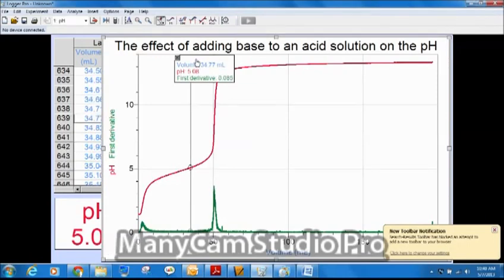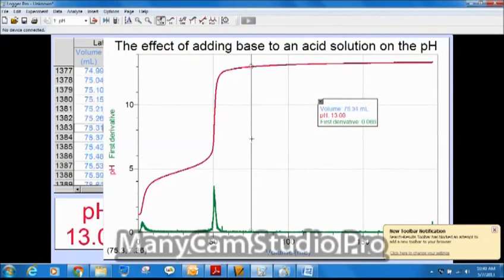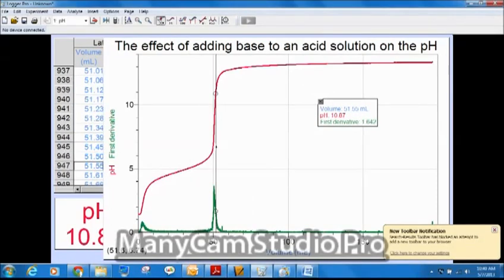But one of the things I've got right now is this box is kind of on top of my line. I'm going to move it over here kind of out of the way a bit. I'm going to go back and put my circles there, that vertical line on that curve. Now, I want to save this graph, and I want to save it with that analysis vertical line there, that examination line there.